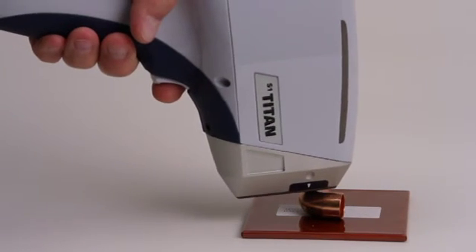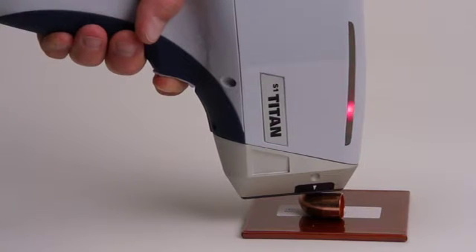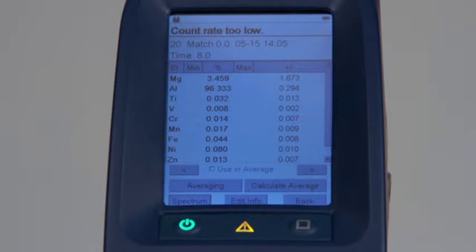In addition to the IR sample sensor, there is a backscatter shutoff. This detects when the count rate falls below the preset count rate. If the sample is removed from the analyzer before the measurement is completed, this shutoff will turn off the X-rays and provide an indication of the reason for the termination of the measurement.